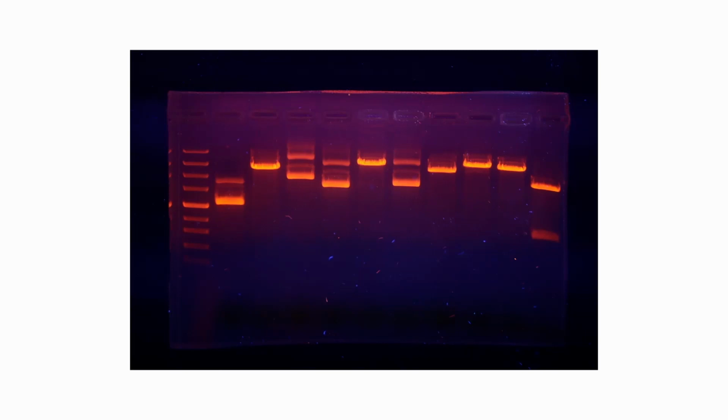So just to drive everything home, let's assume that this gel that you see here is within a gel electrophoresis chamber. It's covered in buffer solution, and on the top part right here, it's connected with a cathode.